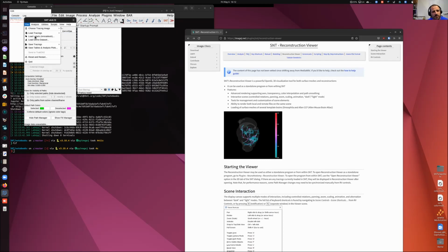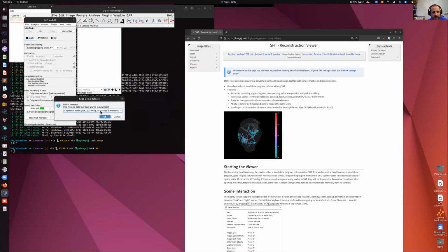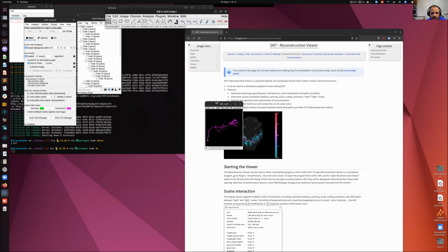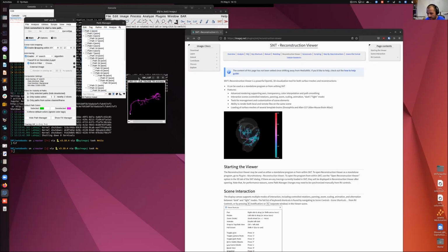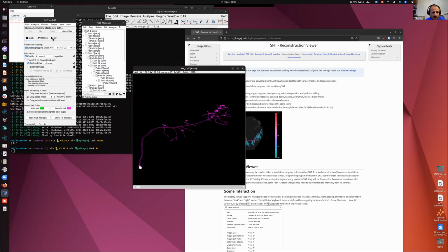So right now I'm going to start. I'm just going to load the demo dataset from here. I hope you guys can do that on your machines. You have a couple of examples here. That's a toy neuron, and that's a Drosophila neuron. Let's start with the olfactory projection neuron, Drosophila. It's a 3D image, quite simple, but it's used extensively in several benchmark studies, and we use it to characterize the problem. So that's pretty much what you have here.